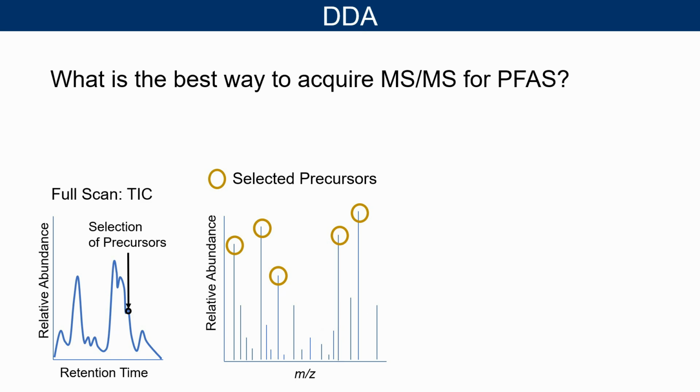For this tutorial, it's just important to know, in case you haven't seen it before, how the MS/MS spectra is acquired. At any point in time as molecules are coming out of the column, we are measuring them and we want to break them apart. We need to isolate them with the quadrupole, we need to measure the spectrum, and all of this takes time. So we can only select a certain number of ions and fragment them.